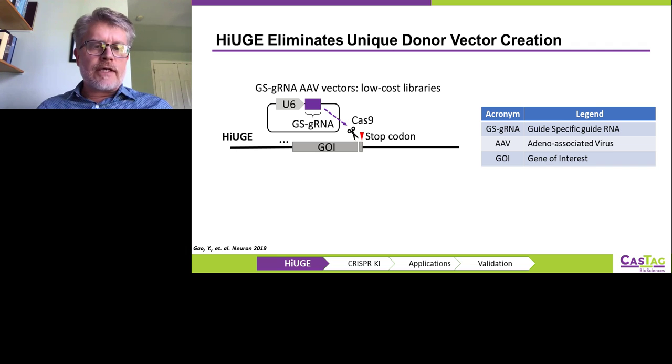This targeting vector is then paired with a unique payload vector. This payload vector is self-cleaving. And so the way that this works is that the payload vector also expresses a donor-specific guide RNA that recognizes a donor recognition sequence. And this donor recognition sequence flanks either side of the payload of foreign DNA sequence that you would like to insert.